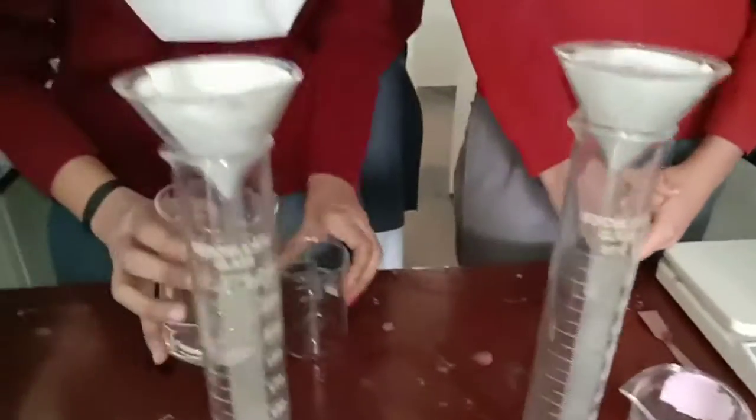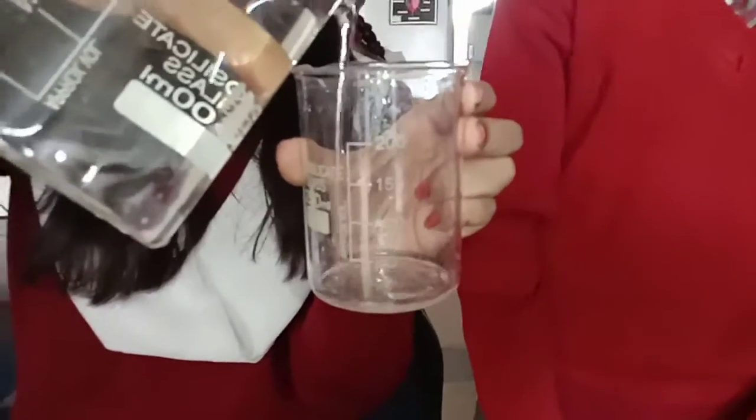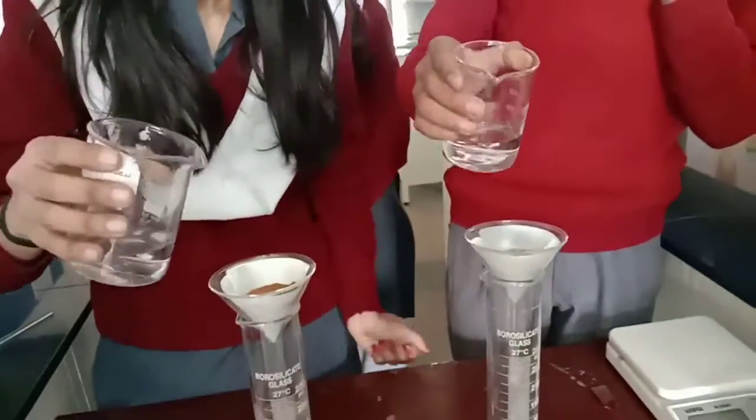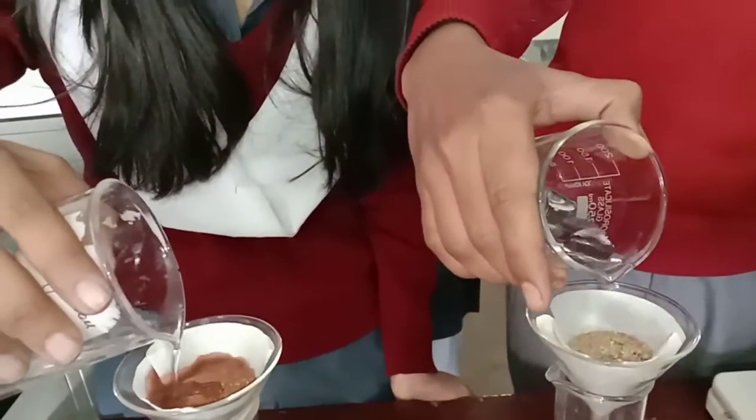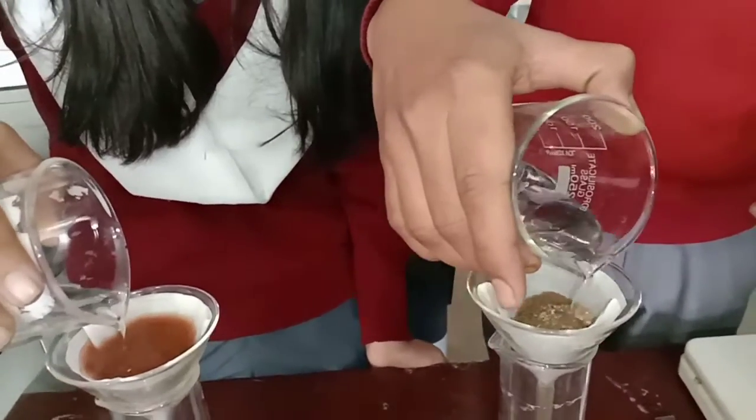After that, we'll measure 50 milliliter of water in this beaker. So we have taken 50 milliliter of water. We will pour this water slowly over this soil.